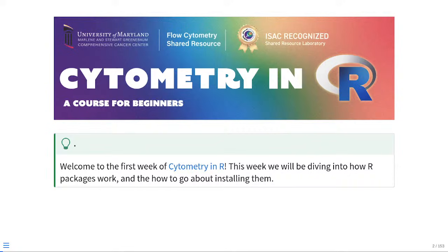Now, some things the course will be and some things the course will not be: I don't want to just give you cookie-cutter code where you just plug and play and get results out, because that's kind of the same situation I was trying to be in back in 2020. What I want to do for this course is teach you how to build the tools that will help you get past any barrier that either R or flow cytometry throws at you.